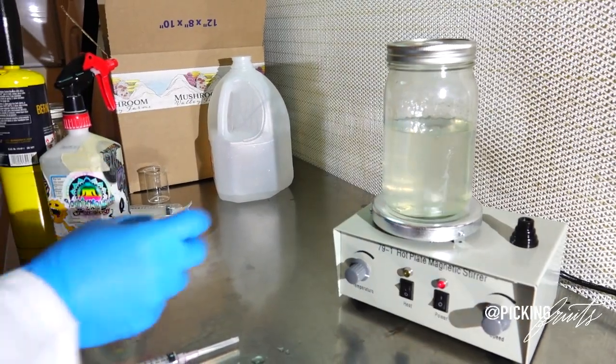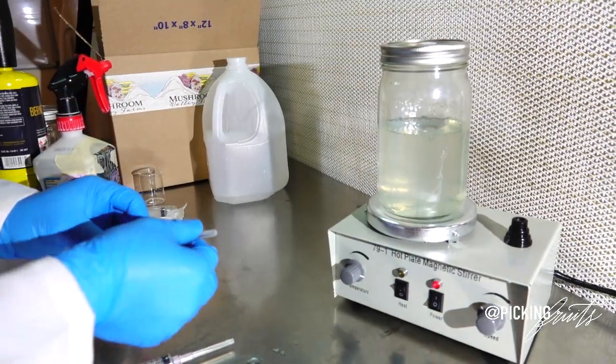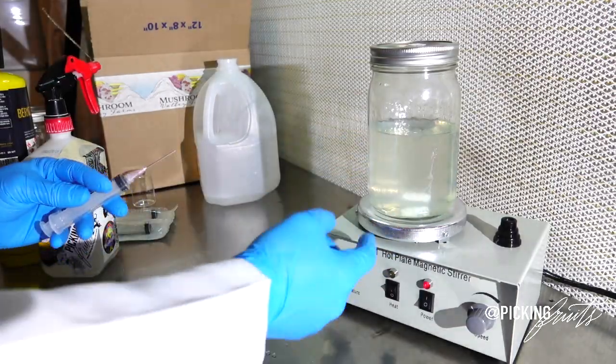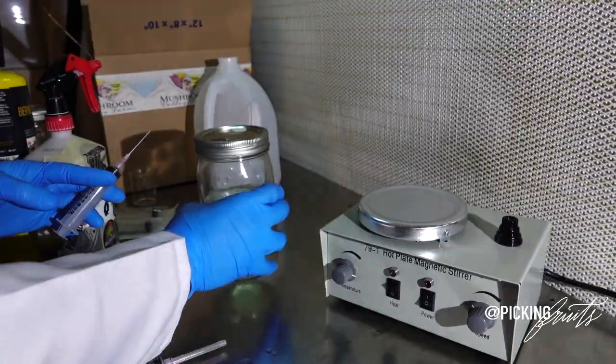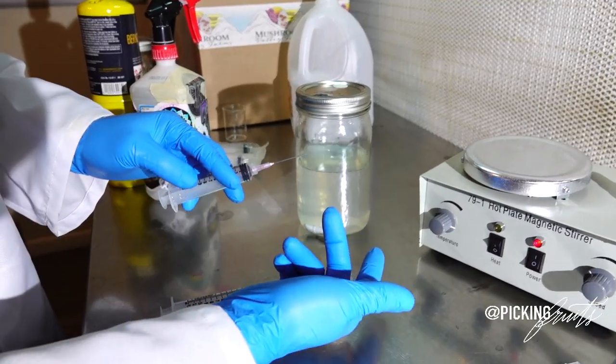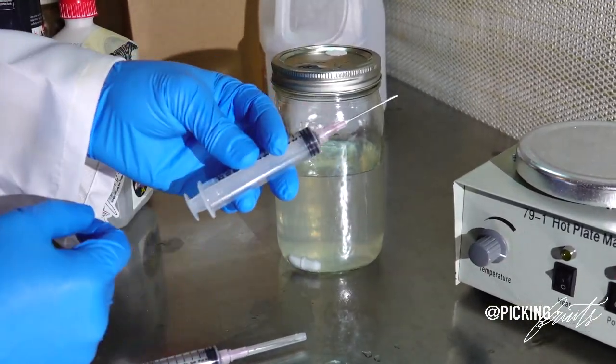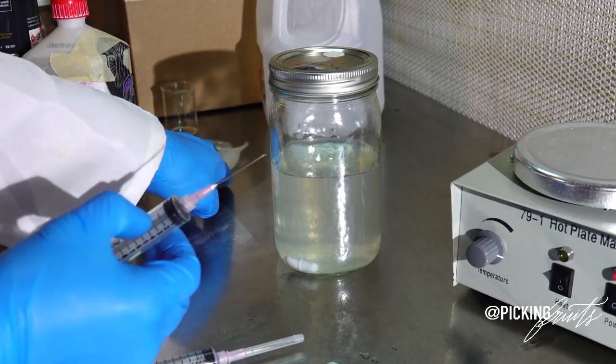So we are going to fast forward and pretend that it has been a week or so and we have a ton of mycelial mass inside of our jar. And now we're going to do the backward process of what we just did. So we're going to take an empty syringe, preferably a new one.